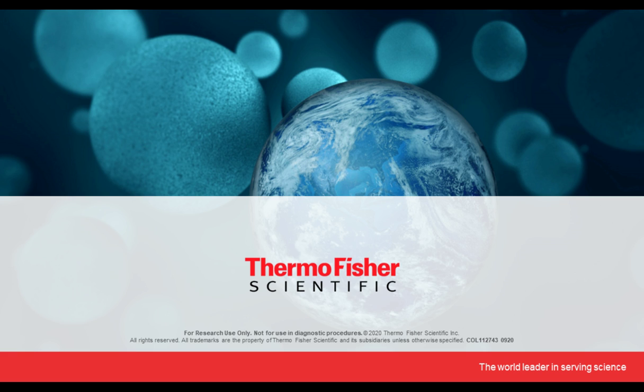And yes, you can absolutely cut the membrane and probe it with different targets. What you can do is either take an image of the entire membrane upfront after labeling, or if you want, you can wait till your entire experiment is done, immunodetection followed by the whole detection method, and you can image along with your target protein. So it has that flexibility because the signal is stable and would last throughout your experimental condition.